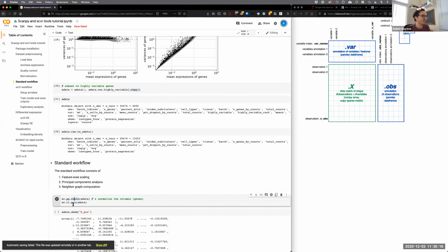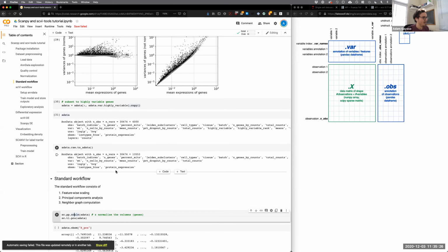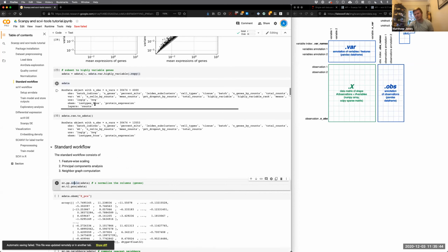Yeah, I mean, definitely in Python, I always try to copy when I'm sure I don't want to alter what was happening before. Like I've had issues with AnnData where I thought, if you initialize an AnnData object with data, and then you edit, and then you have a variable A and then the AnnData, and you edit one of them, you're actually editing both of them because it's pointing to the same memory. So it's just good to be explicit about these things, I think. Exactly. Yeah. You can also see in pandas.